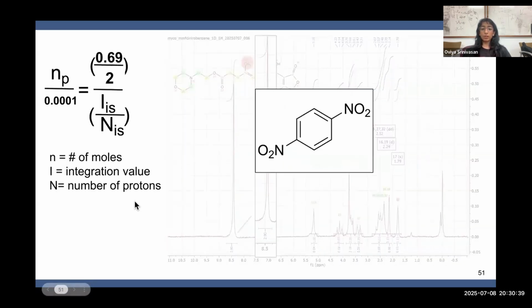Because 1,4-dinitrobenzene is a para-dinitrobenzene isomer, the two nitro groups are opposite each other on the benzene ring. This arrangement creates a plane of symmetry that makes all 4 remaining ring protons chemically equivalent.